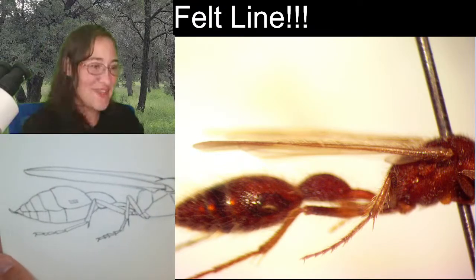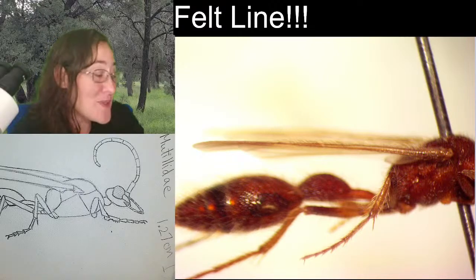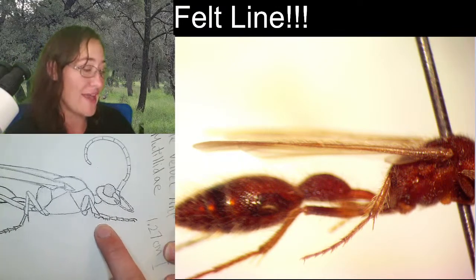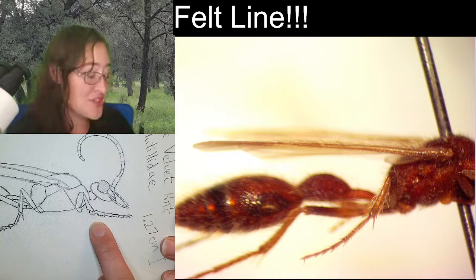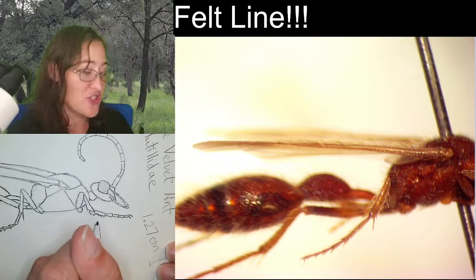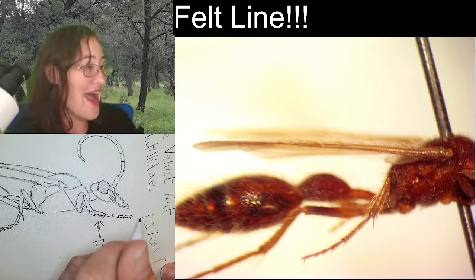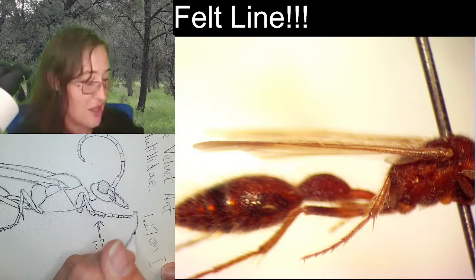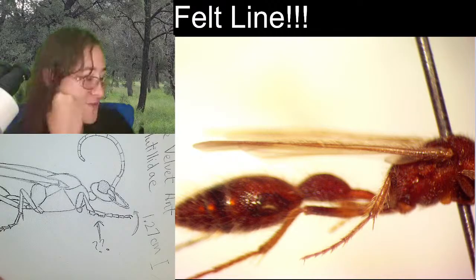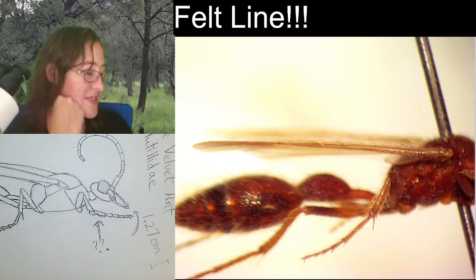Awesome. So that's our friend here. I hope that you enjoyed drawing him. I certainly did. I think I enjoyed the antenna and the legs. I was surprised by the first tarsal segment of the front leg. I don't know what this U thing is for, and I want to know what this is for. And I am honestly curious about the length of the maxillary palps, because it makes sense for other insects, I think, but I'm not exactly sure what those long maxillary palps would help this velvet ant do.